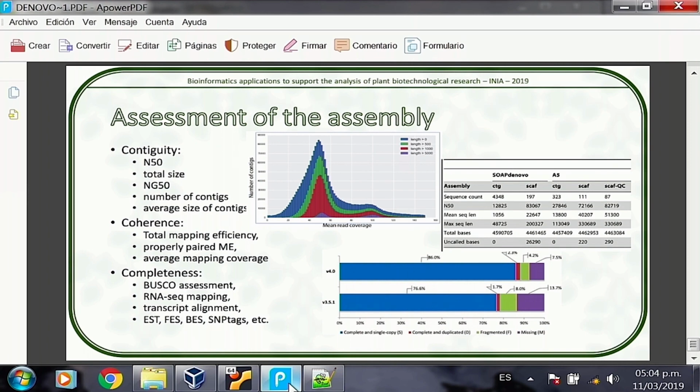If we don't have that, if we have regions of the genome that have much lower coverage or much lower depth than that, then that's an indication that there is something wrong with that position of the genome. For some reason, that position of the genome doesn't have enough reads represented. It is possible, and this is just a conjecture, that maybe this region is underrepresented in the library construction method we use. Yes, it is possible, but it's unlikely.